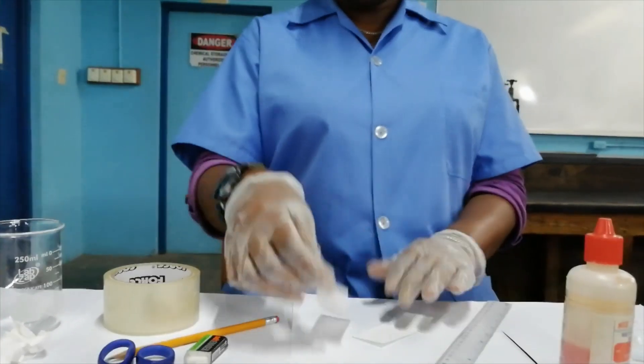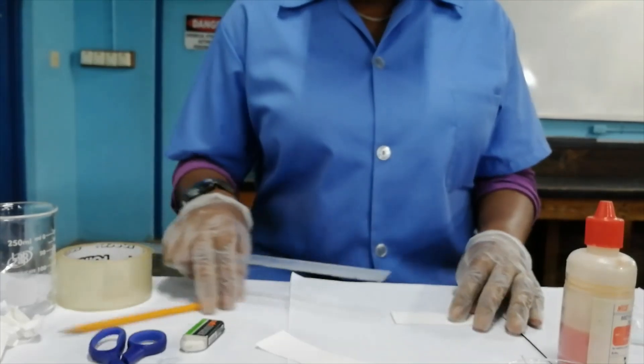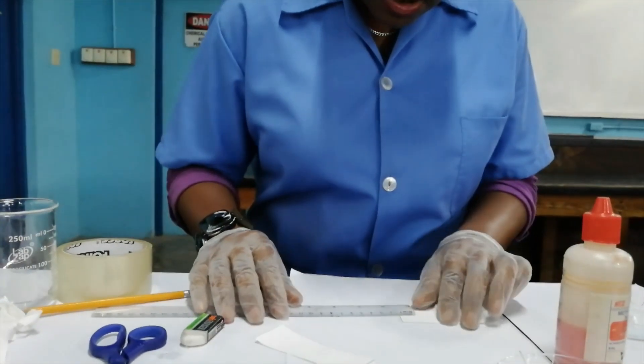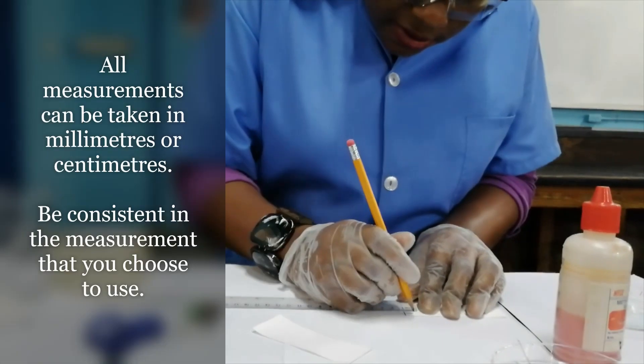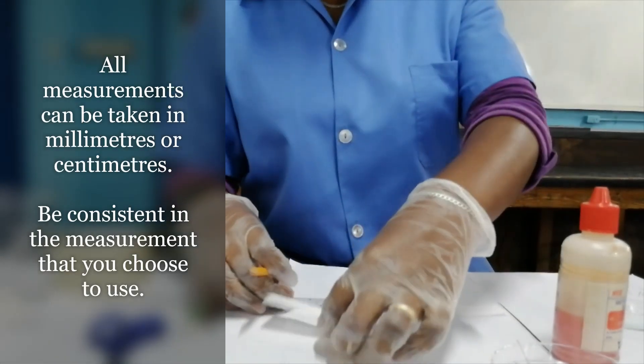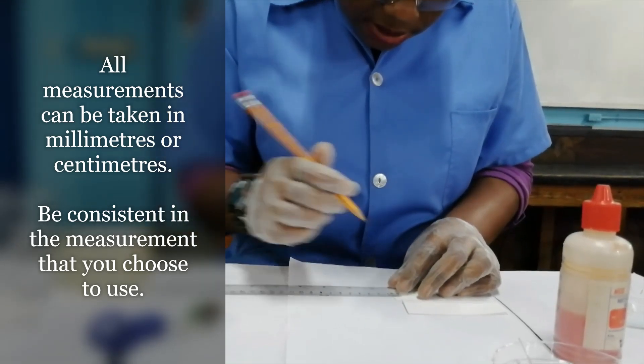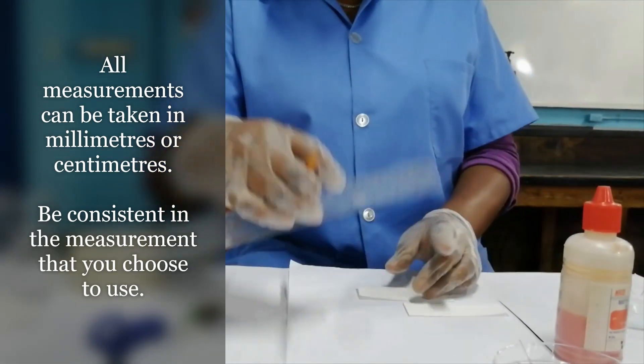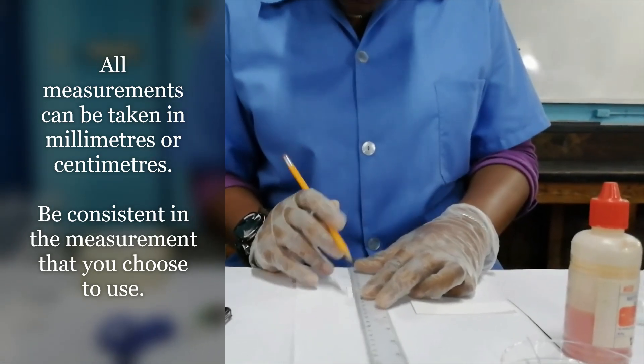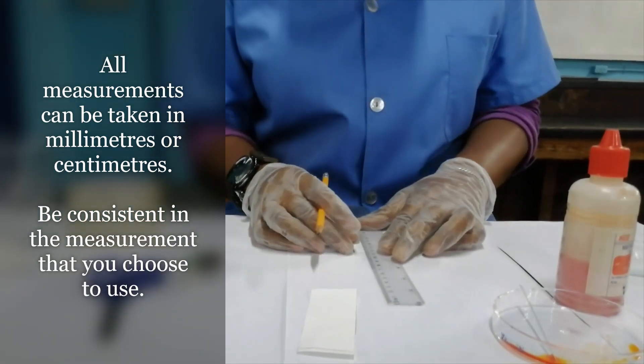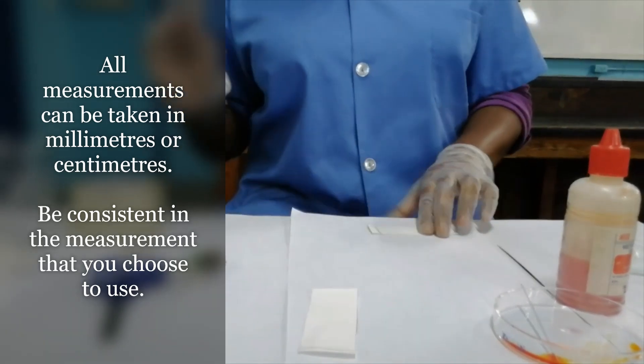When we're doing this technique, the spots of the sample need to be placed on the line of origin because you'll have to do a calculation. The line of origin is the baseline and it can be one centimeter from the long edge or 0.5 centimeters. I'm going to do one that is one centimeter and one that is 0.5 centimeters from the long edge.